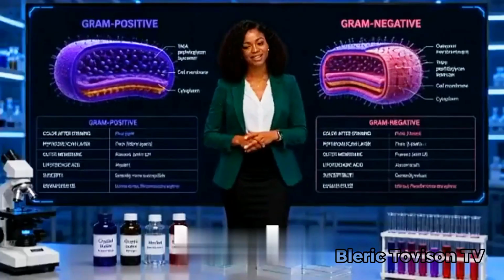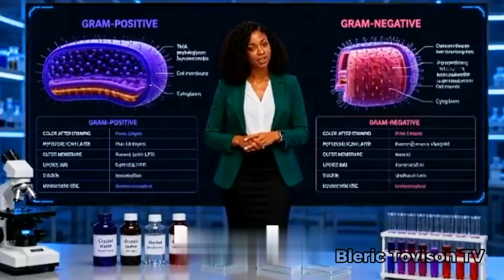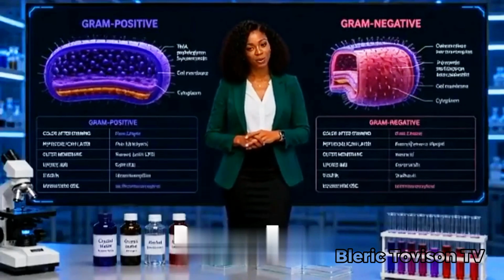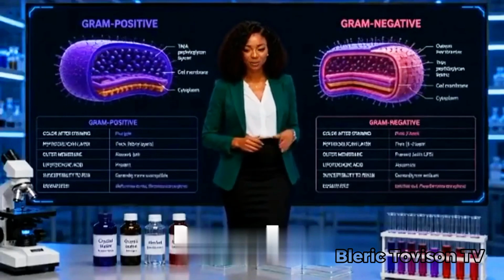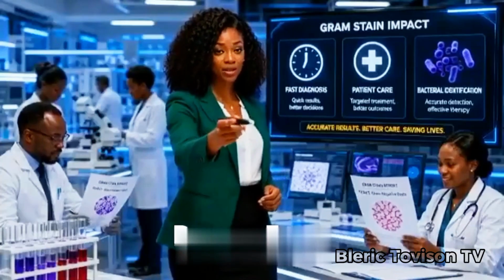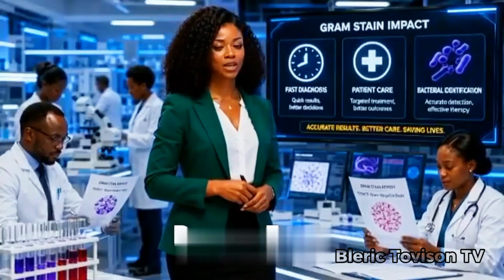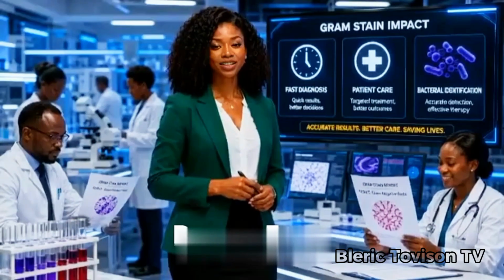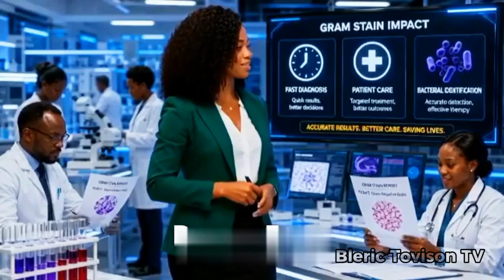When compared side by side, the differences become obvious. Gram-positive bacteria appear purple with thick cell walls, while gram-negative bacteria appear pink with thinner walls and an outer membrane. Several errors can produce misleading results. A smear that is too thick, overheating during heat fixation, using old bacterial cultures, or incorrect decolorization can all lead to inaccurate gram stain results.